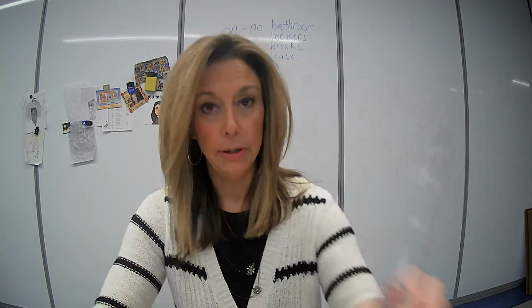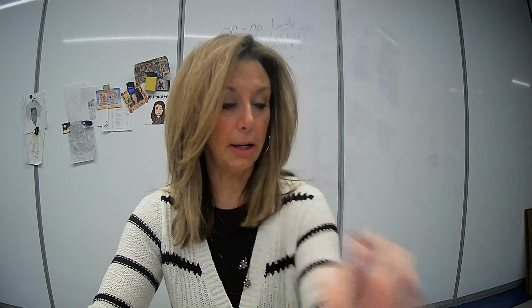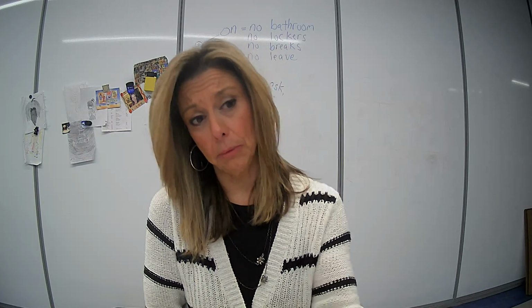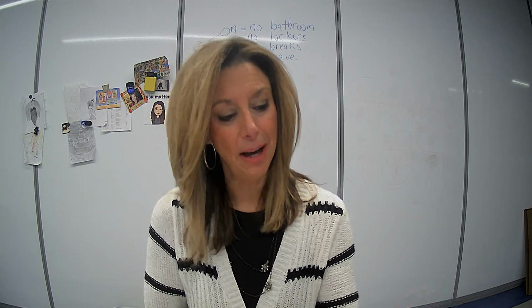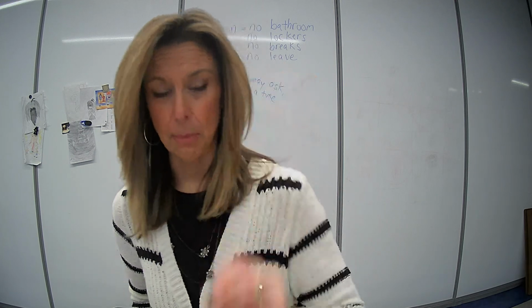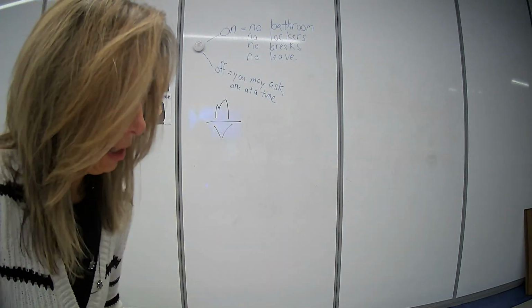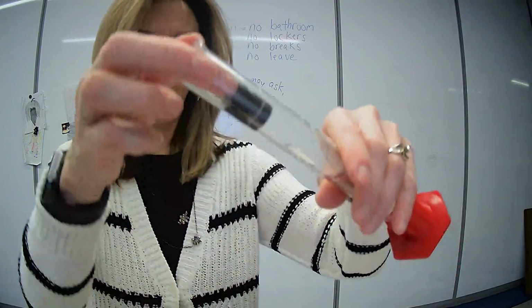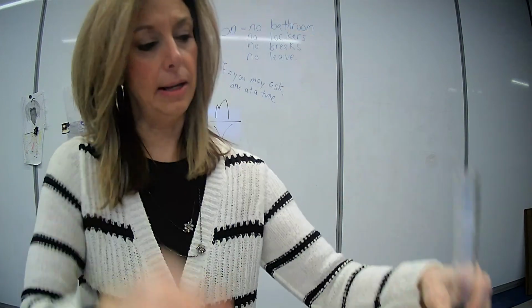We know that we start with a certain amount of water. There's 25 milliliters in this graduated cylinder. I will place the cylinder into the graduated cylinder, and then we'll see the water rise. We'll subtract the original amount from the new amount, and then we'll get the volume of this cylinder. We'll start with this small one. I'm going to just carefully guide it in there.